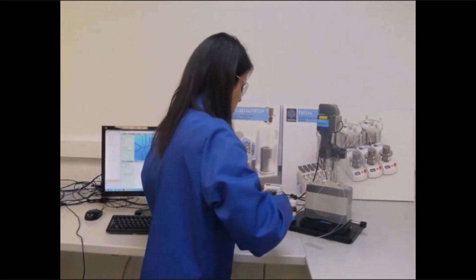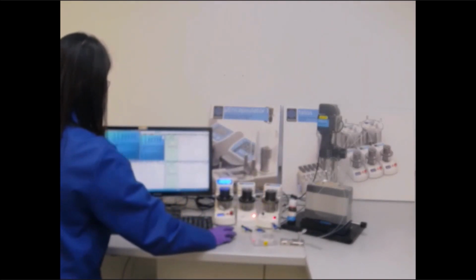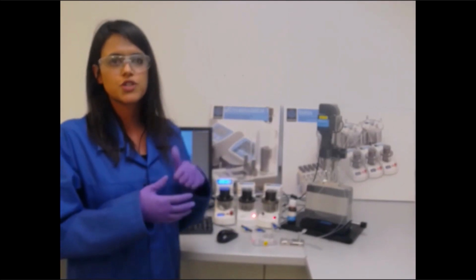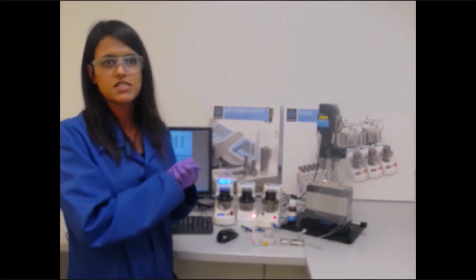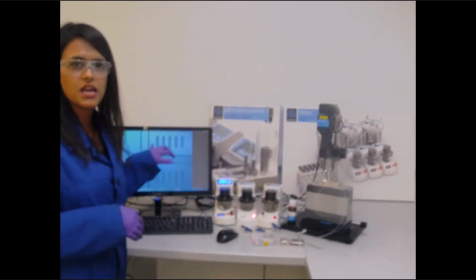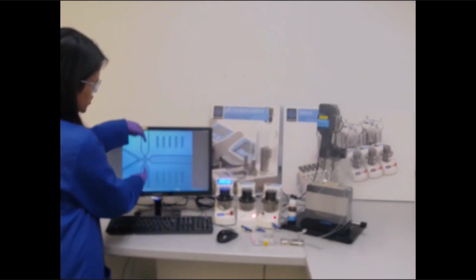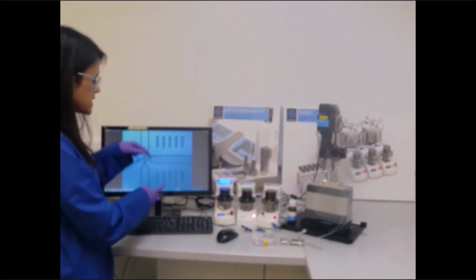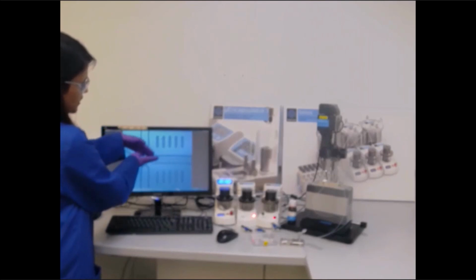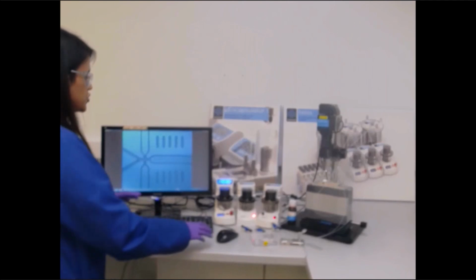So once we've got that, we've got an FCC running here. I will show you a little bit of a pre-recorded one, just because this is live at the moment and it's difficult to share. But so you can see that the droplets are being produced. This is a 13 micron fluorophilic chip. And we've got our FluoSurf, which is an emulsion stabilizer, pinching the droplets from this way. And we've got, let's say, the cells and the beads coming through this way. And you can see very nice monodispersed droplets being produced.